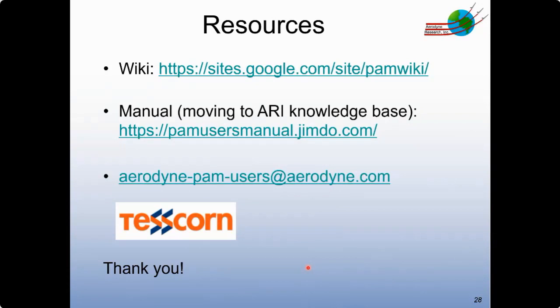Okay. Yeah, one last question. Is it possible to perform aqueous phase reactions like sending atomized droplets? And is it possible to collect the droplets, condensed liquids from the PAM reactor for further analysis? That's a topical question to ask because I had a conversation with a colleague on Friday about whether aqueous phase chemistry can be done by sending in droplets at high humidity.